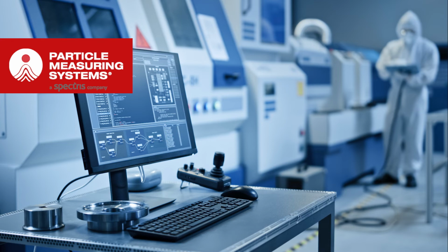So are they exposed to operators? Are the materials exposed to the environment? Is the process exposed to the environment? These are all high probability. But then there's also the subtle bits, could an operator knock the probe accidentally doing their usual tasks? And if they can, you're going to get a false positive, and that doesn't do anybody any favors.